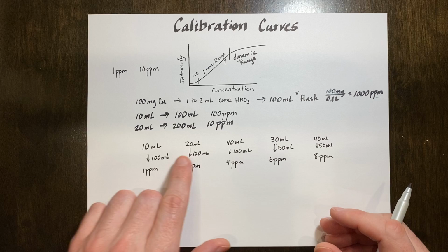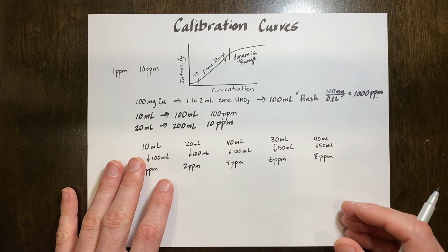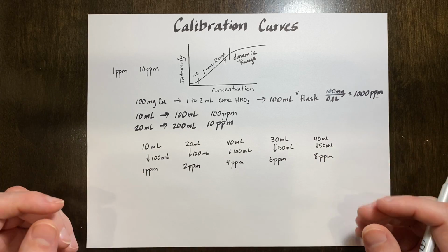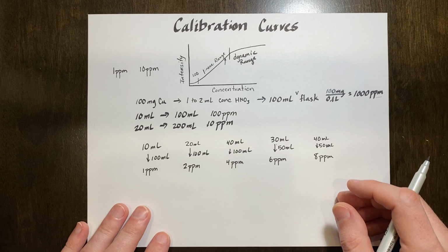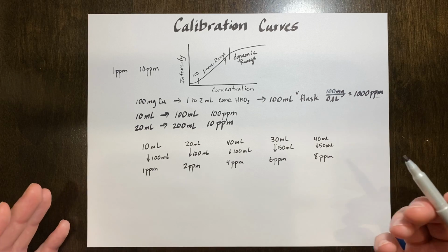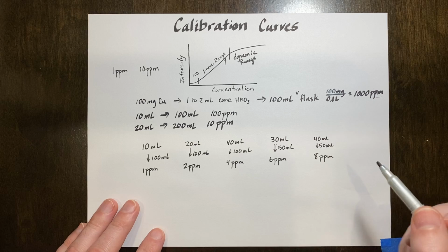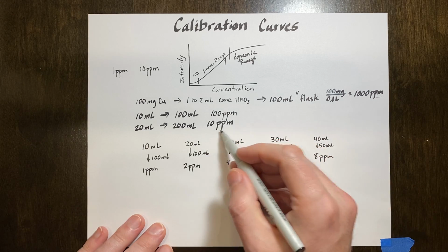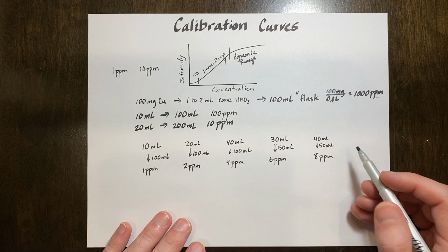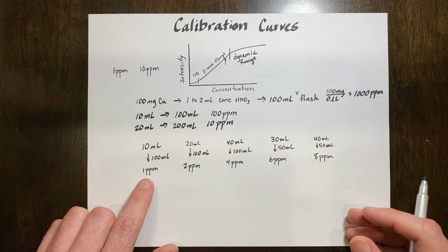And then if we add all of this up, I should have used about 140 milliliters. Of course, there's always a little bit of loss. Somehow, magically, you end up using slightly more than that. But that will leave at least some, around 50 milliliters of my 10 part per million solution to use for that standard. So then I could just use this stock solution, but it's also my top standard. And so that's an easy way to make a calibration curve.